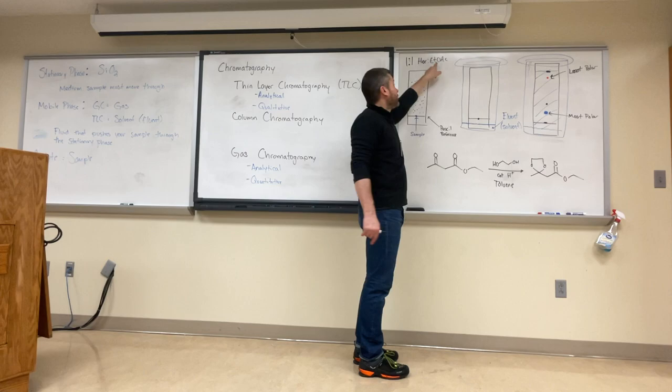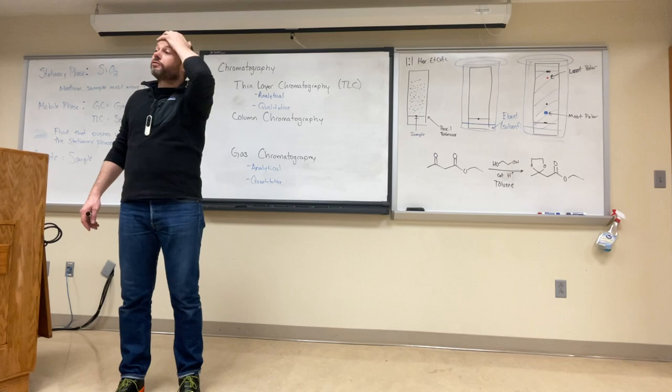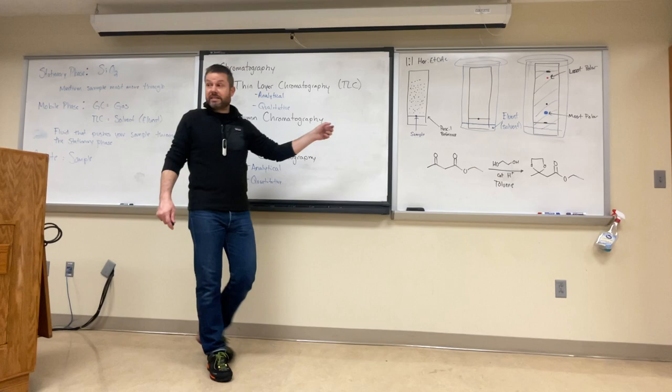So in addition to this, are we also running our samples through the IR and the GCMS? Not today, no. So after you purify this compound, so column chromatography, which we'll talk about in a quick second. So this is purified. This is not purified. This is analyzing, yeah. Right? It's an analytical method.